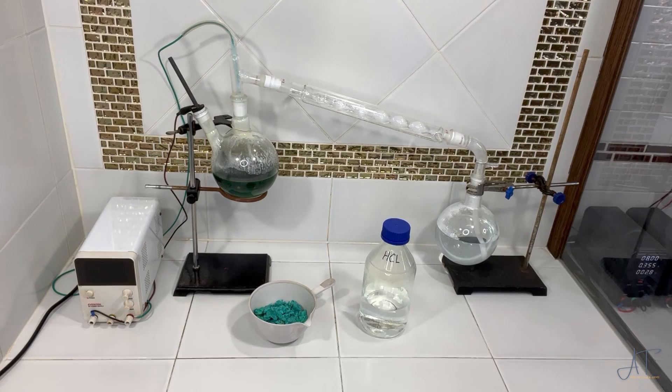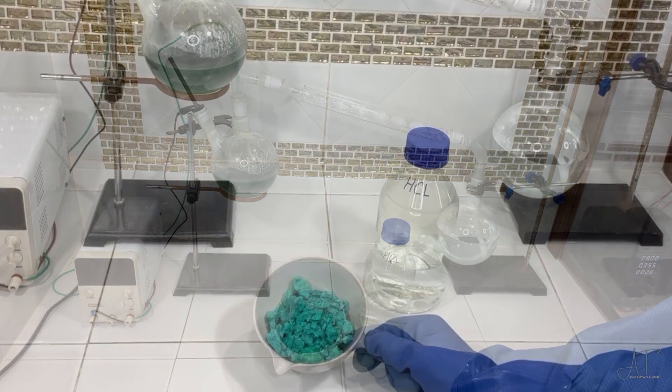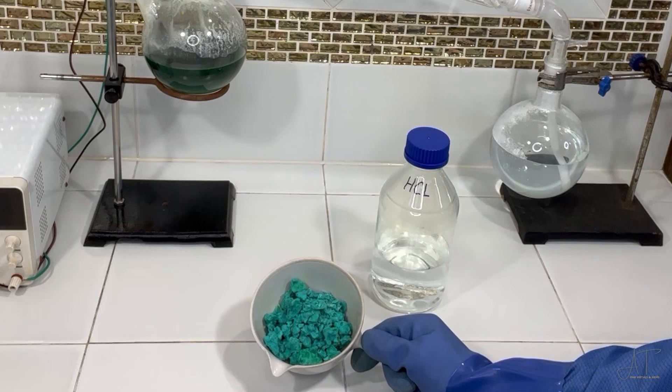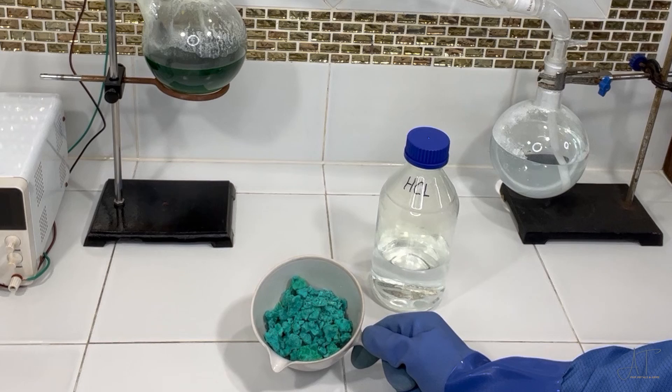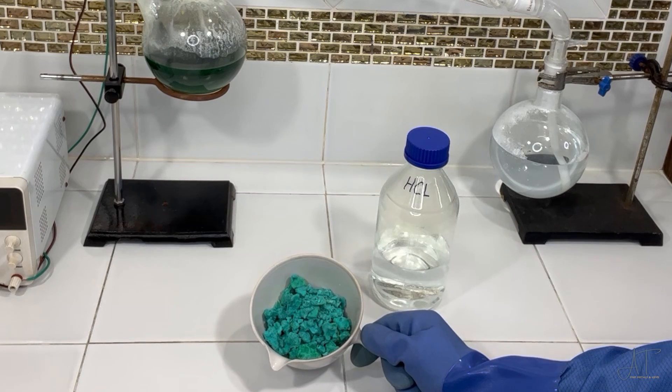We've finished the distillation and came up with this compound here. We're also going to take this substance, which is basically copper 2 carbonate, re-wet it with water, possibly add a little bit of hydrochloric acid, and then put in aluminum. The aluminum will displace all of the chlorides — all of these metals are in there in a chloride form — but it will displace them back into their metal form.